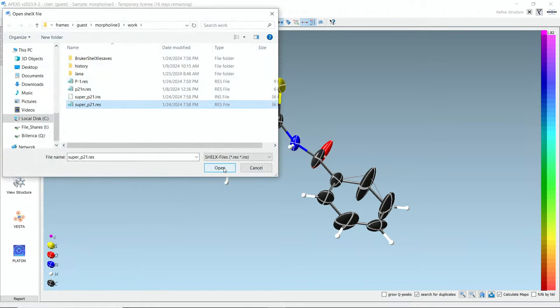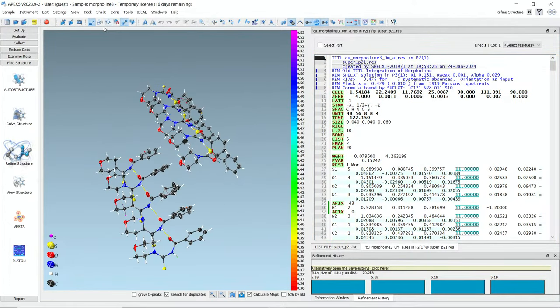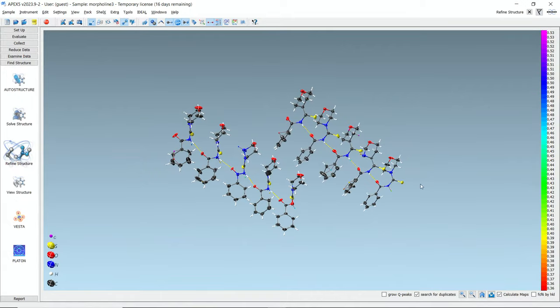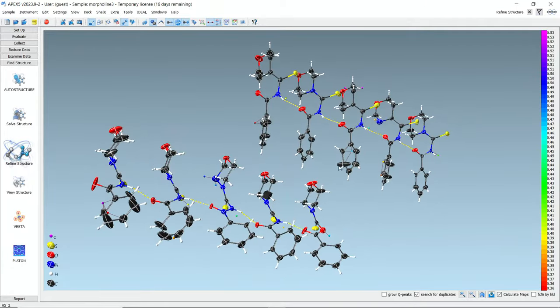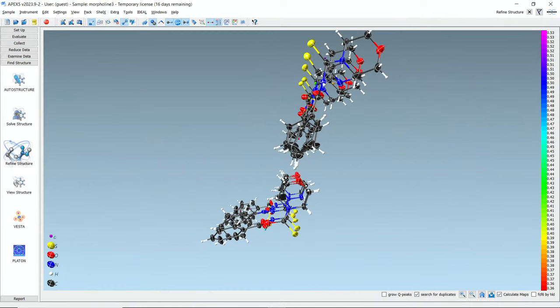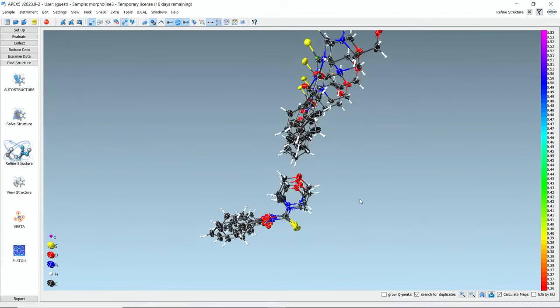Then it's P21. We lose the glide plane, and so this is how the structure looks then, and you also will get an idea why the thermal ellipsoids are so large. So this looks already much better. It's not perfect. You see, some of them are still bad, but when you look at the projection of this, you would expect that they line up really nicely. Do you see what kind of a mess this is down here?